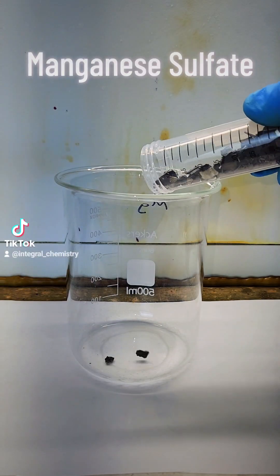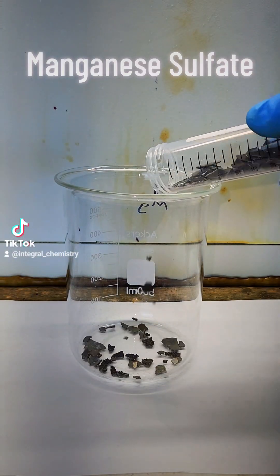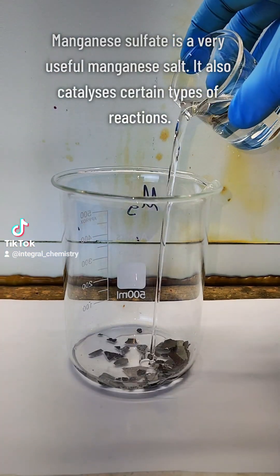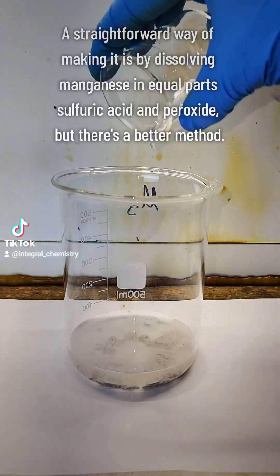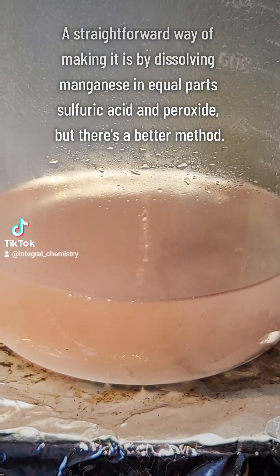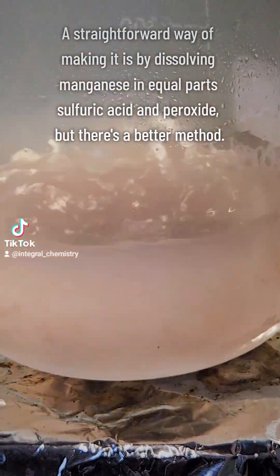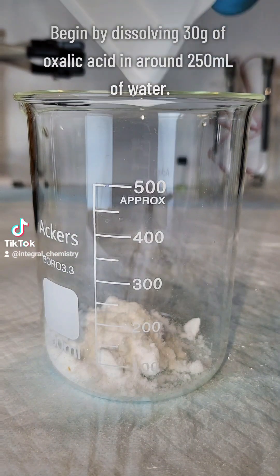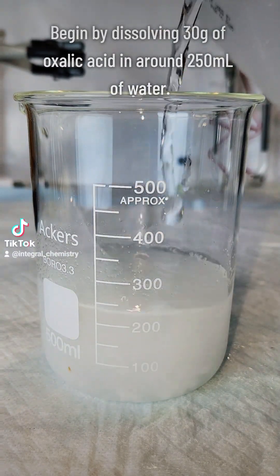Today I'm going to demonstrate two methods for the synthesis of the useful salt manganese sulfate. The first is the more direct route of simply dissolving manganese metal in a mixture of hydrogen peroxide and sulfuric acid. This route is okay, but due to a variety of reasons I'll explain later, it's kind of hard to obtain a pure product this way. So I'm going to show you a method I think is better.